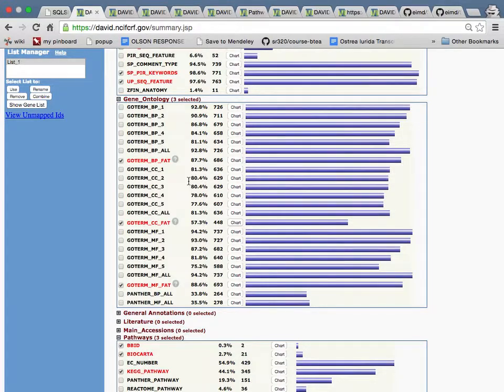Is that the general or is it just for this particular data set? All this information is referring to what is enriched in the female only context, based solely on annotating it to the Swiss Pro. So I gave it all of the Swiss Pros, and that's the background, the big list, and then I gave it the Swiss Pro proteins for the female, the 800 for female only, and that's what it did the analysis on.